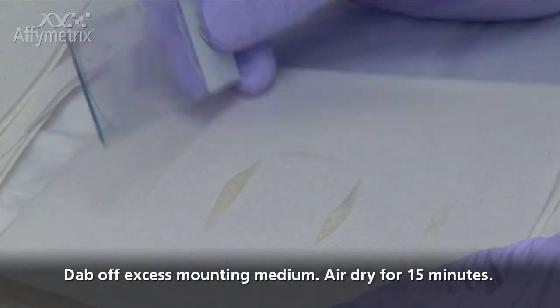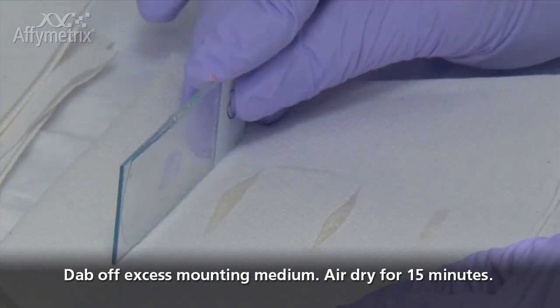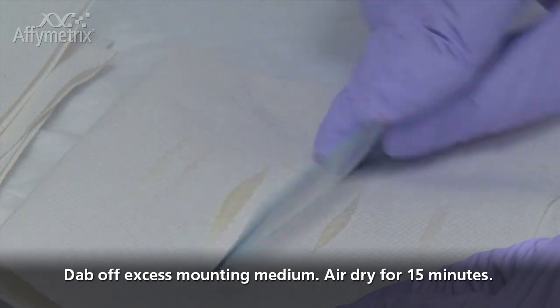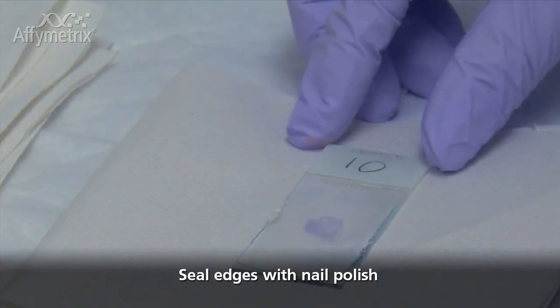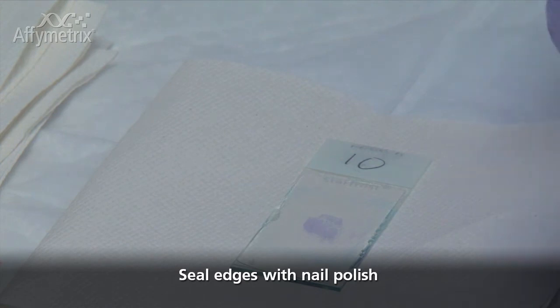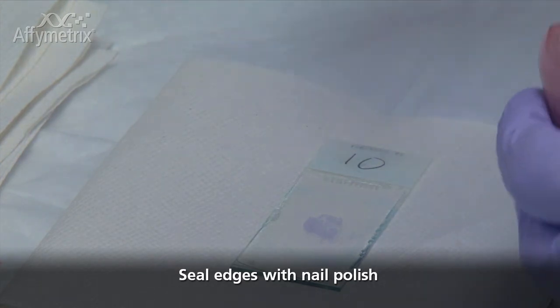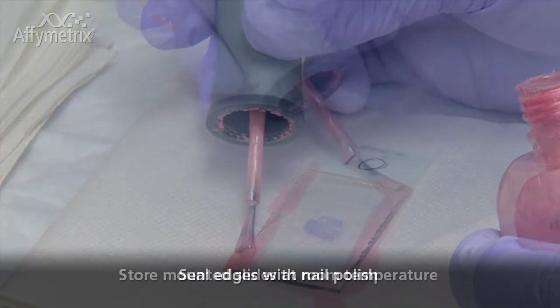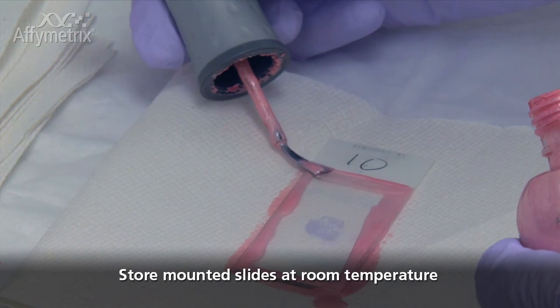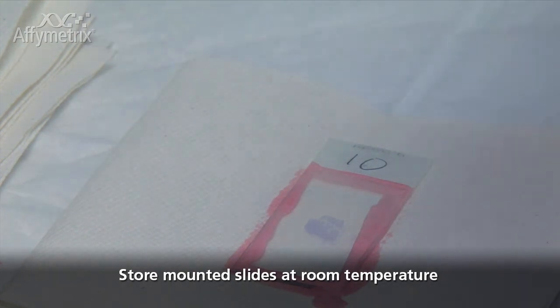After mounting, flip the slide over and place it on its edge on a laboratory wipe to remove excess mounting medium. Allow slides to dry at room temperature for 15 minutes. Do not bake slides to speed up the drying process. To prevent bubble formation, seal all four edges of the cover slip with nail polish. Slides mounted with the Inovex Advantage Mounting Medium can be stored for long term at room temperature.